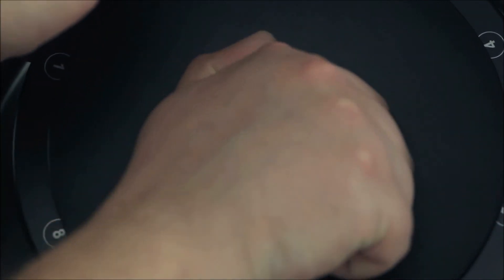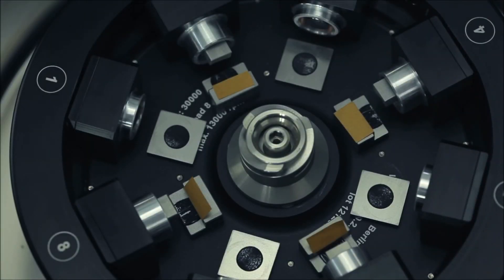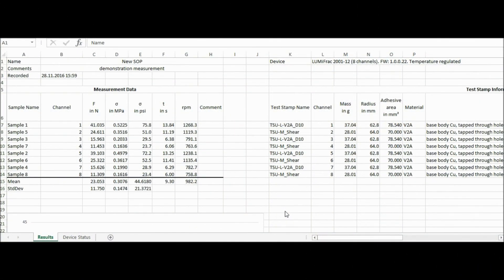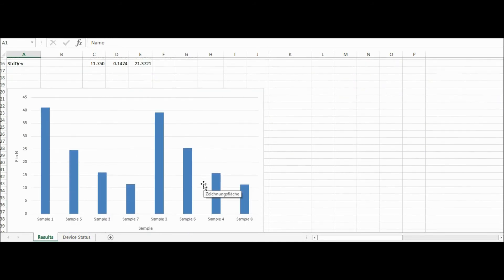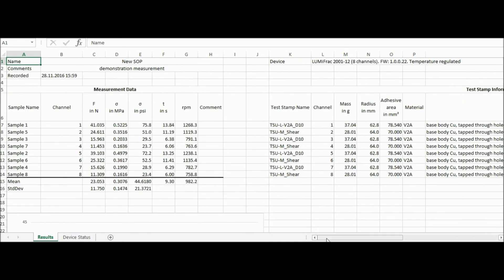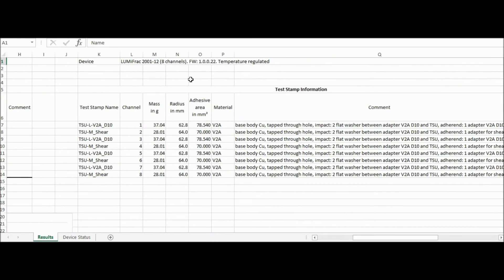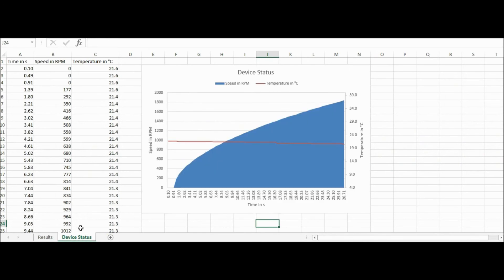The measurement either stops automatically or by a simple click on the Stop button. As you can see, all the substrates have fallen off. Returning to our analysis, we now show you the corresponding Excel files after download. The measurement results are shown left of the export file along with mean and standard deviation. The test stamp data are listed on the right. The numerical data from the speed and temperature graph are listed on the device status spreadsheet.